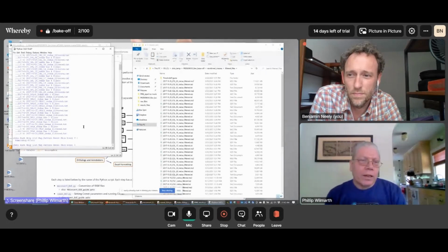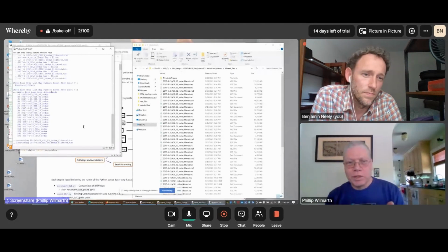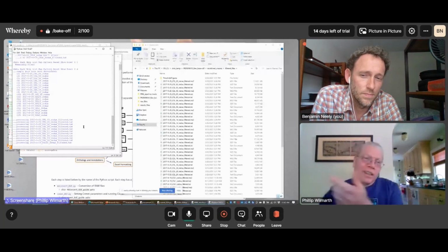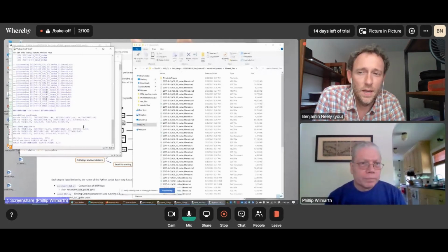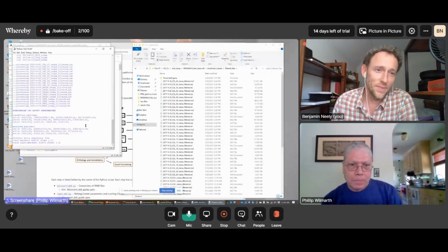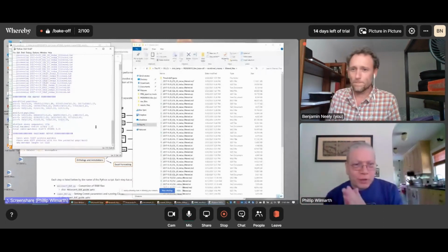So we're done. It reads those files in and starts this reverse mapping. So these files come in as: here's the peptide sequence and here's the protein accession that it goes to. So now we start turning it around. Every time we see a protein accession, we make a new data structure, and then we stick all of the different peptides that come to that protein. And then when we get done, we'll have a whole bunch of proteins, and we can see all of the different peptides that are associated with those proteins, and then we can start doing protein inference. And again, that will allow a peptide to go to more than one protein.